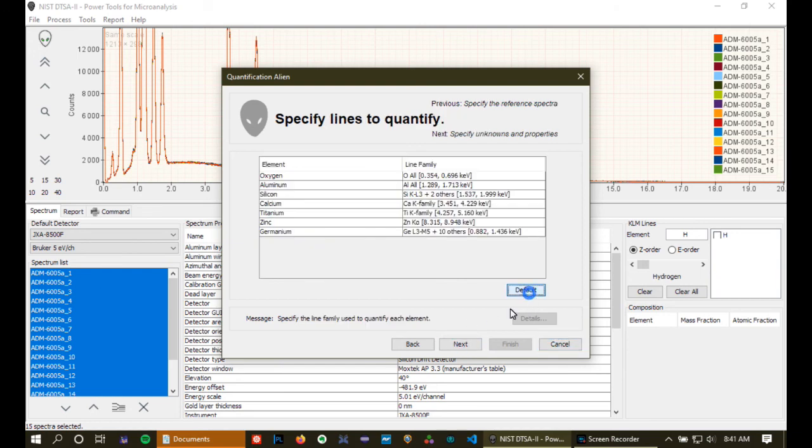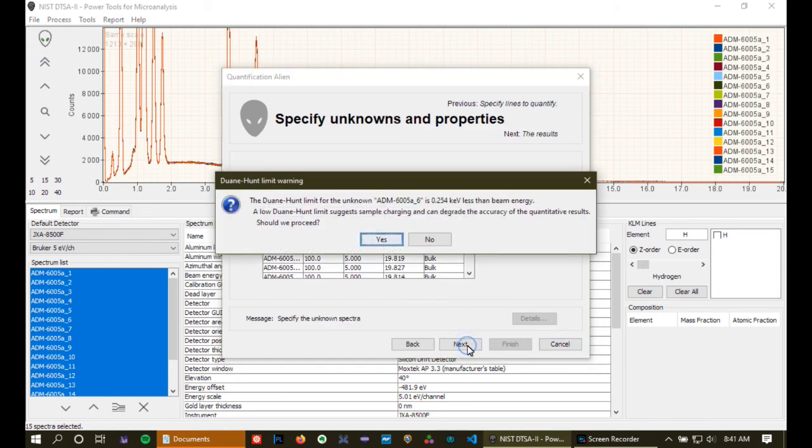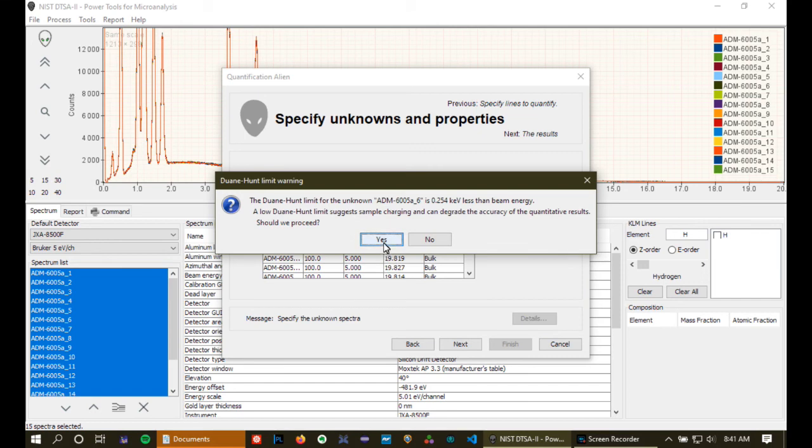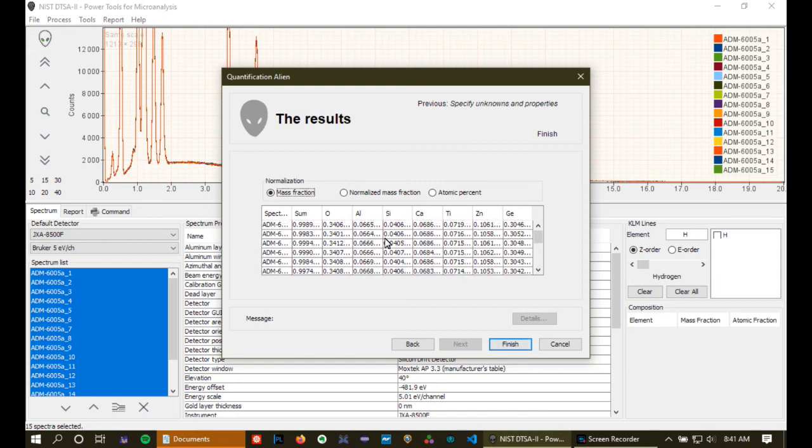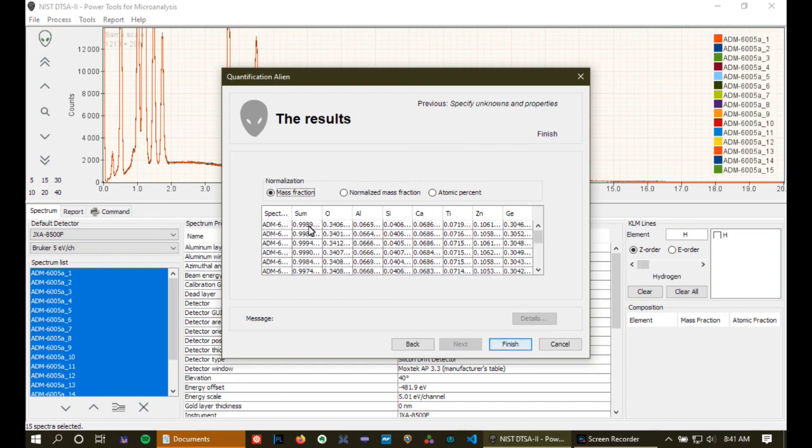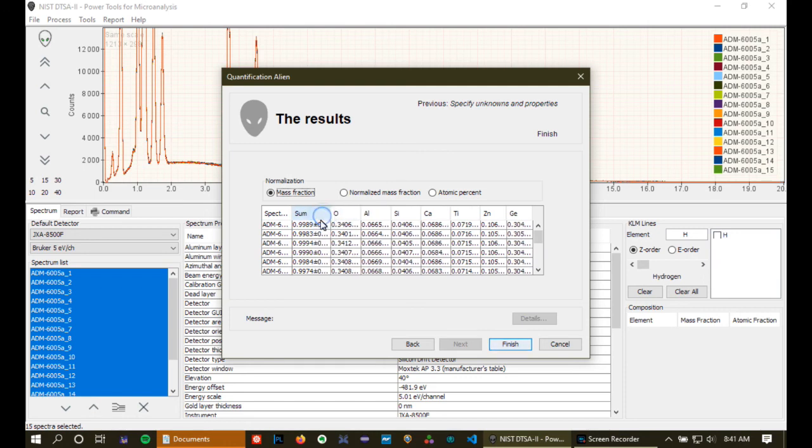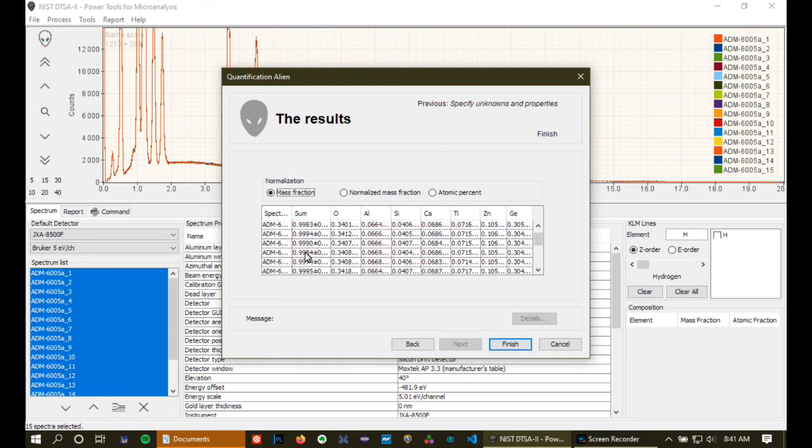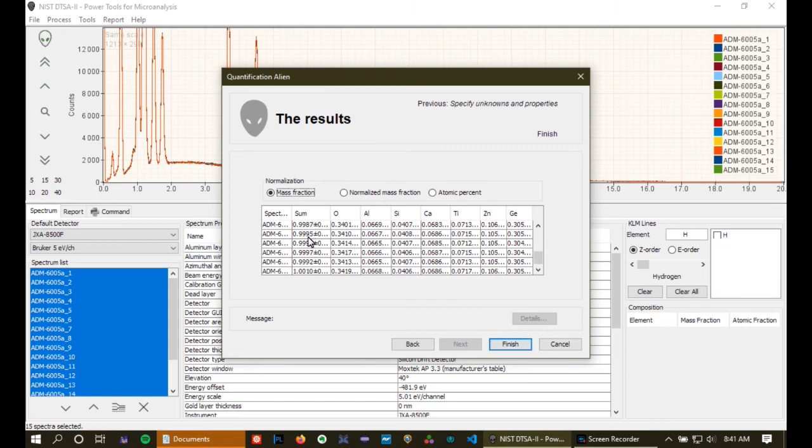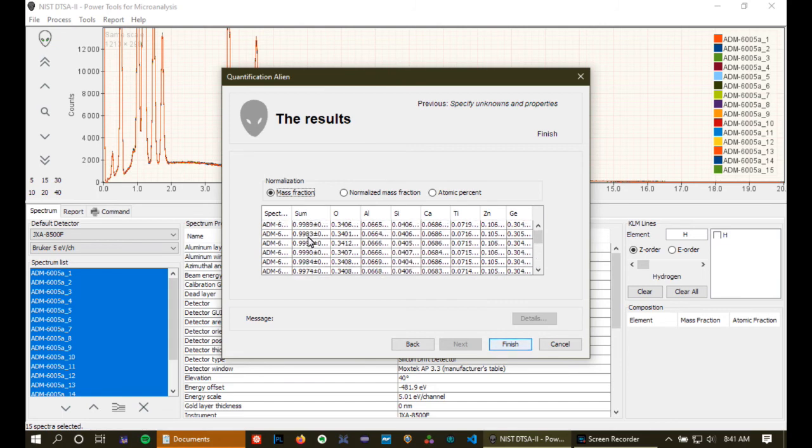Go through. And quantify. That complains about the Duane Hunt for one of them again. But otherwise, we're okay. Okay. And when we do that, we see that our analytical totals look really pretty good. Very, very close to unity, as we would hope they would for quantifying material against itself.